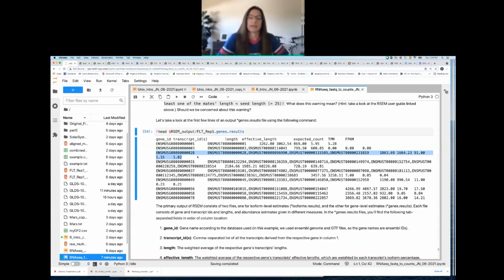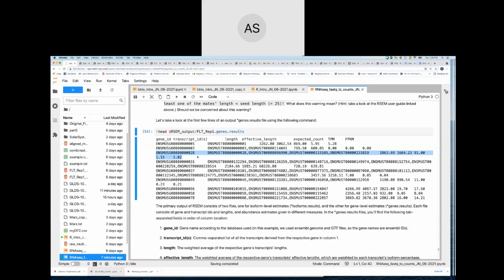Zinru, why do you expect it to be the same? You can unmute your mic. Since this is by gene ID rather than transcript ID, it makes sense for you to sum all of them together based on the number of individual transcript IDs that we see in the transcript file.